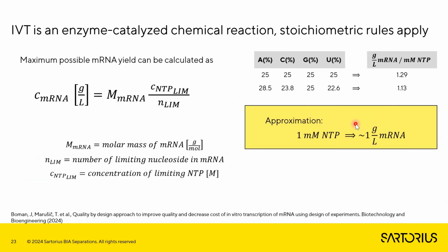One thing that we also defined very early on, which I think was critical to the success of the exercise, was first the understanding that mRNA production is a chemical reaction, and as such is governed fundamentally by stoichiometry of the reaction, meaning we need to understand how many moles of reagents can turn into how many moles of product. We need to think as chemists.